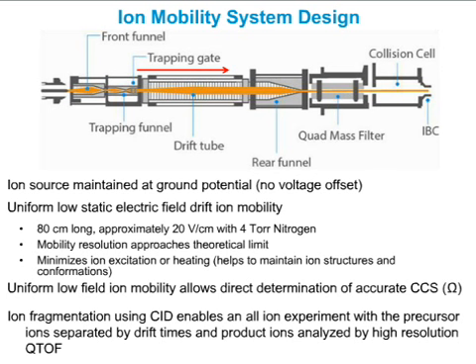At this point, the gas from the capillary can diffuse and be pumped away while the ions are contained and focused by the ion funnel. They then go to the next vacuum region into the trapping funnel, which is labeled trapping funnel. And at this point, after we collect ions for about 1 millisecond, we pulse these ions out, and then they go into the drift region, and they drift through the gas.